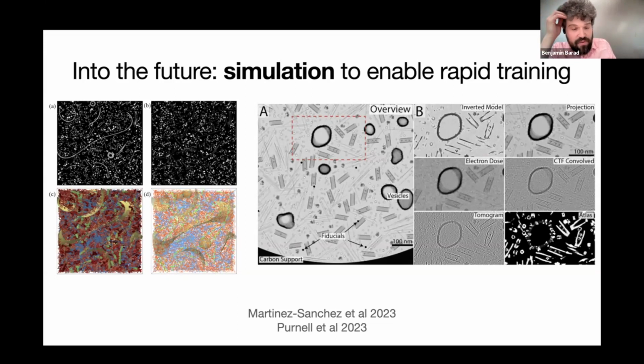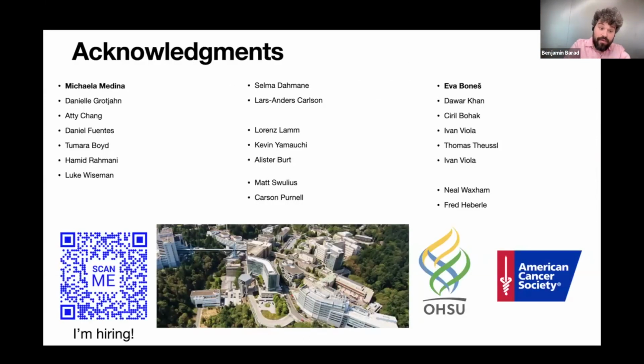So I think in the not too distant future, the way that Membrane Seg has, for us, solved membrane segmentation now, I think the same will become true for a lot of the other aspects of segmentation, including filaments and membrane proteins and other features.